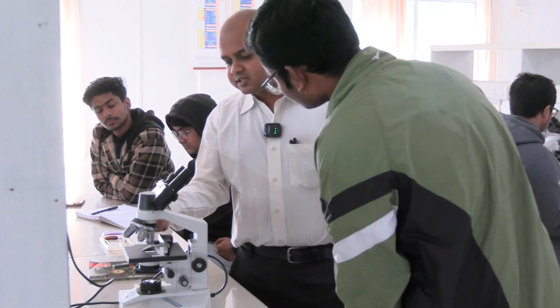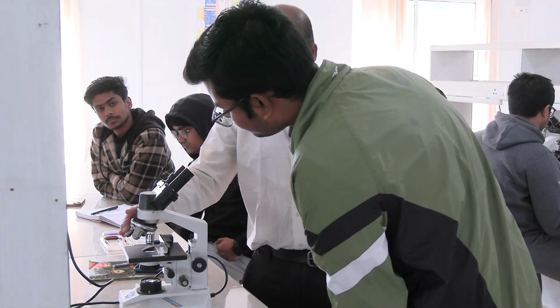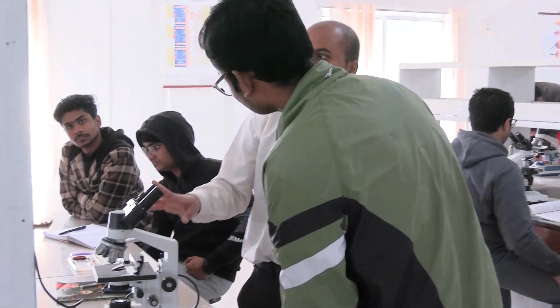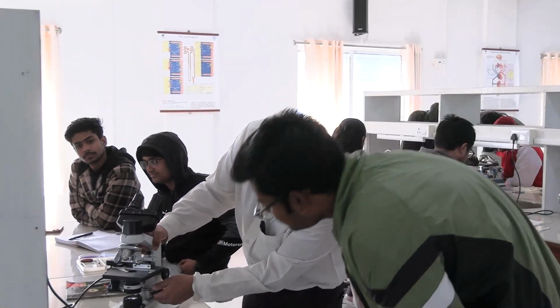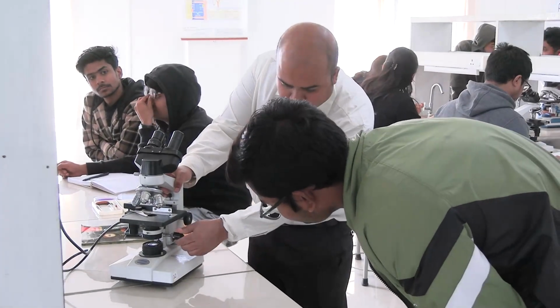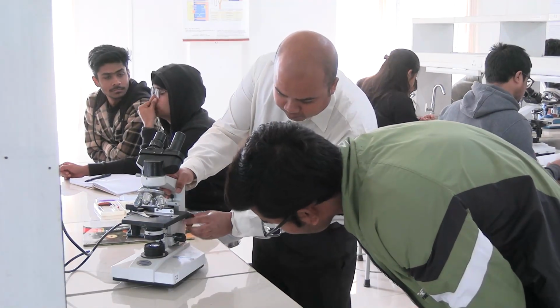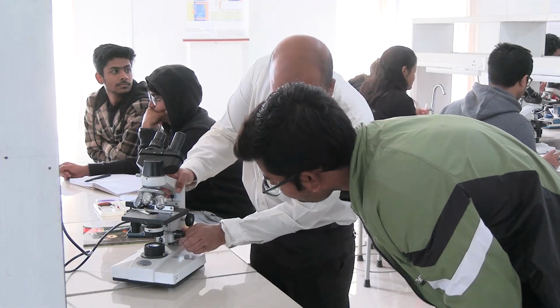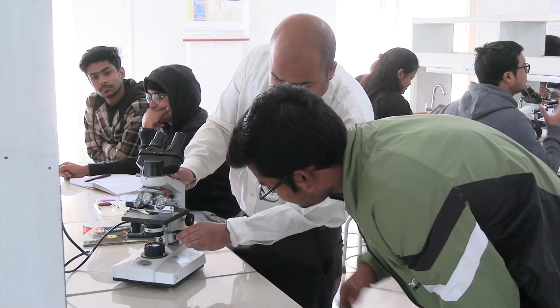These are the different objective lenses. If the 10x lens is used, the 10x means it magnifies the object 10 times, and the eyepiece also magnifies 10 times. So total magnification is 10 into 10, 100 times. Then how to use the light source: there is something called the condenser. See, the condenser goes up and down with the help of this screw. This is another screw for adjusting the position of the condenser. This is the coarse adjustment screw, this is the fine adjustment screw for fine tuning the focus, and this one is for adjusting the condenser.